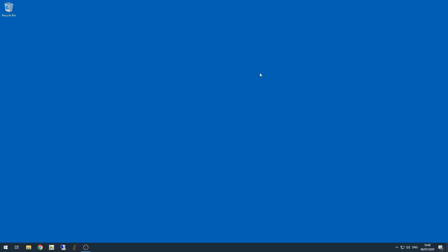When you're first setting up your 4Pi microscope, you really want to confirm that your computer is connected with all the PI stages and everything is working as expected before you do anything else.